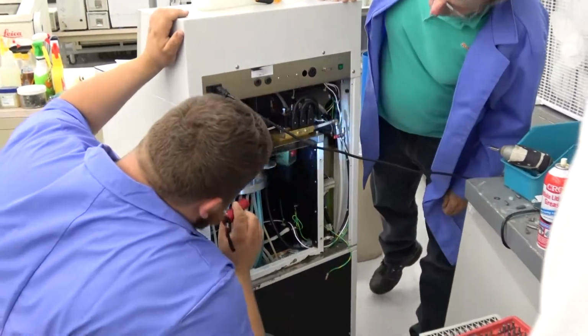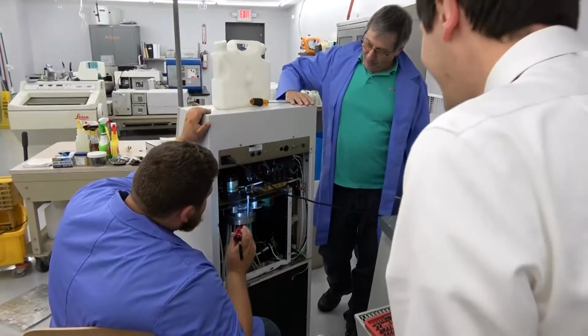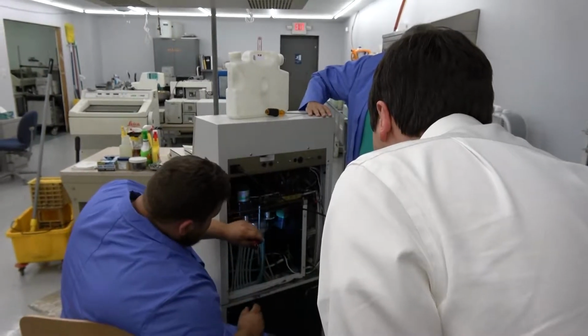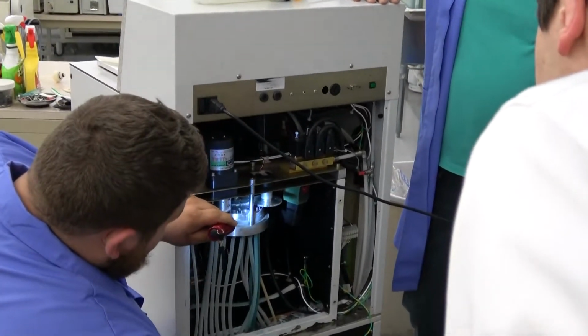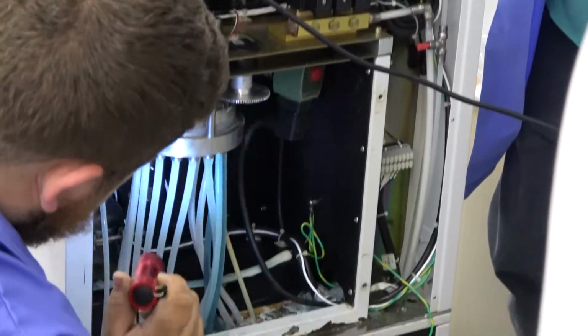We had a leak coming from the retort, so the line comes from back here and goes into the solenoid here. That's where we were leaking, so we took that line out, put a new hose in, and put it all back together, and we're just watching to make sure we're not getting any more moisture coming out of anything.